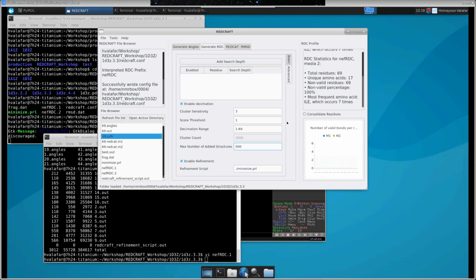I suspect your proteins may not behave well in the aligned samples, but in some circumstances it may be justified if you just cannot collect the NOEs that you need to fold your proteins. Maybe you should spend a little bit of time to see if you can get a compatible alignment medium.